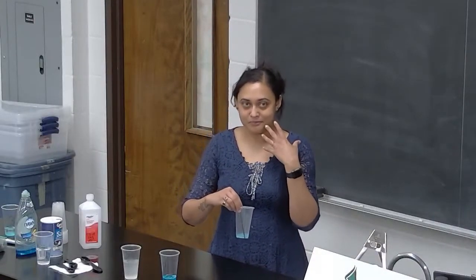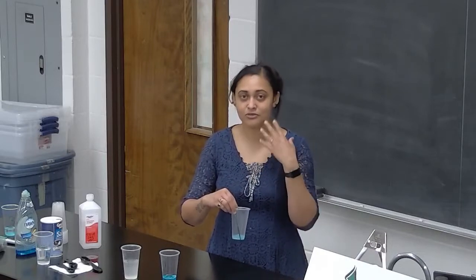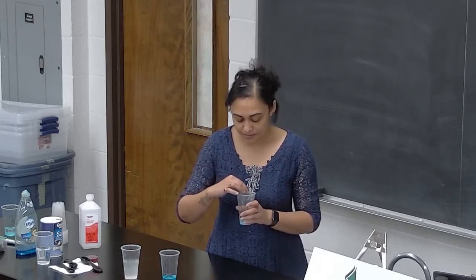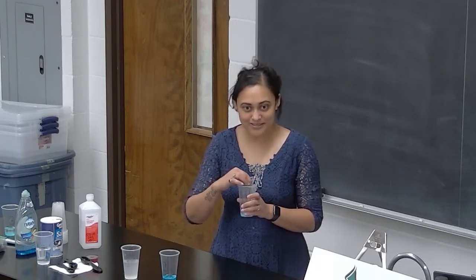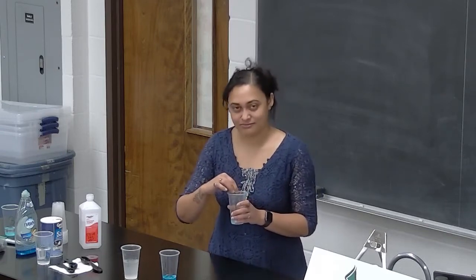For 30 seconds or so, work it in your mouth so that you get as many cells as you can from your mouth. And try not to eat right before doing this experiment. Then you'll have food in there also, so that will be more gross.